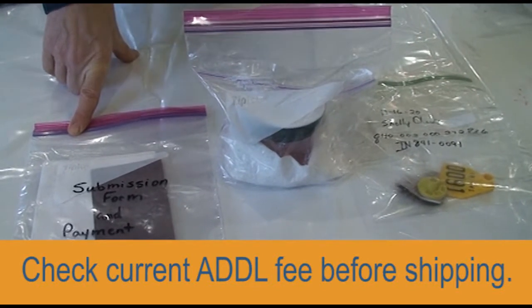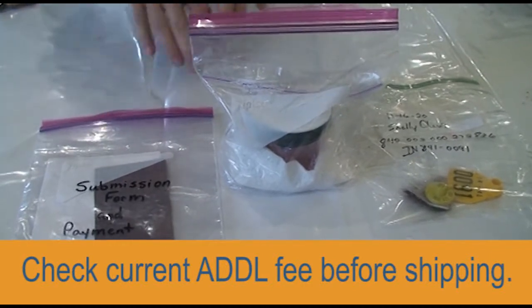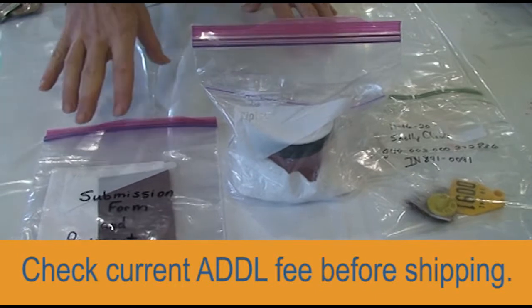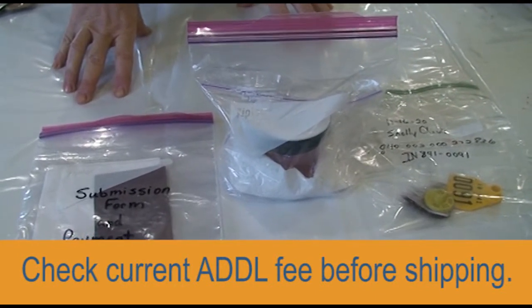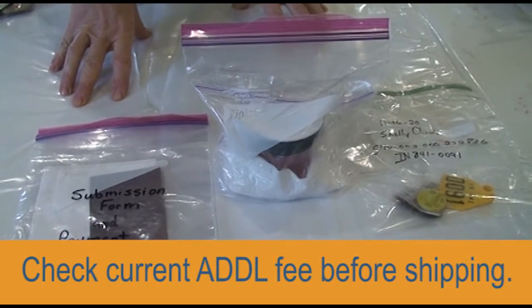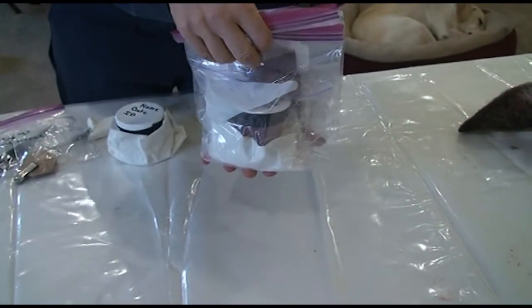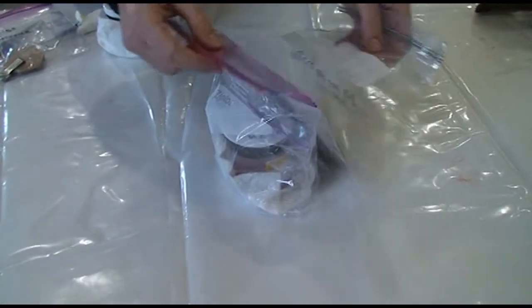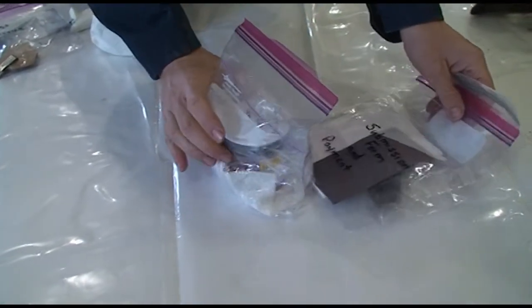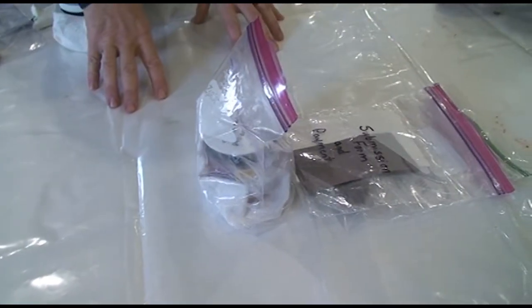1 sample per submission form. If you sampled 3 deer heads, you can write 1 check. You can just take the 37 times 3. 1 check made out to Purdue University. And then these 3 bags get put into a gallon bag and then put into a shipping container of some type. You do not need to send an ice pack, but they should get sent so that they go overnight. But as long as you do UPS, they will go overnight to the diagnostic lab from anywhere in Indiana.